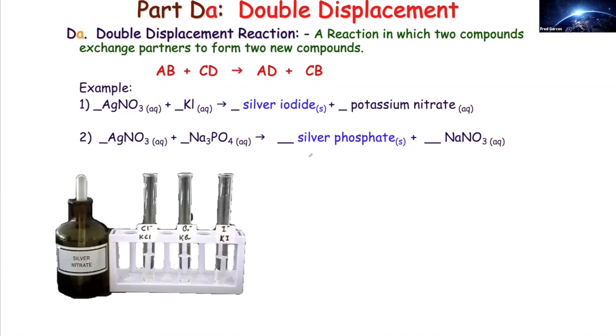Okay, this is a reaction actually right here. These two reactions we actually do in our lab. One is the silver mirror experiment. It's a pretty cool experiment. What happens is you take some silver nitrate and potassium iodide, and then through the double displacement, you get the silver iodide coating the inside wall of the test tube. So it looks like your test tube converts into silver. It's called the silver mirror experiment because the walls of the test tube look like a mirror. But I apologize that you guys don't have a hands-on experience in doing that. That's probably the coolest experiment in this particular lab.